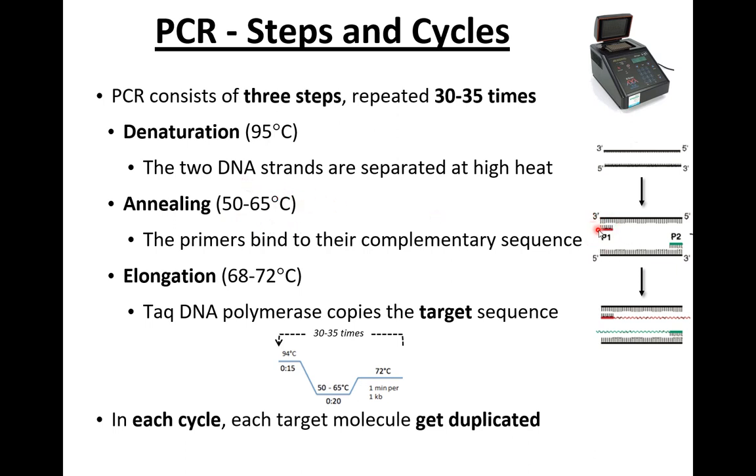And that's a step where the primers that you have designed will bind beside the target sequence. So this will be the target sequence that you're trying to make several copies of. And now the primers will be designed to bind right beside it. Okay, so these are designed to be complementary ultimately to the sequence in the opposite single-strand DNA molecule.